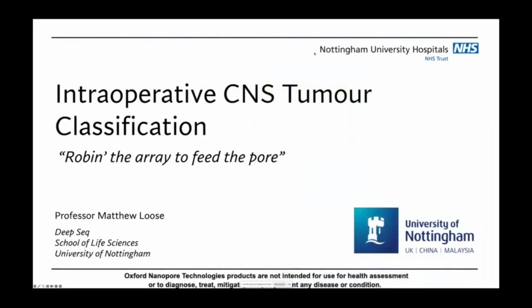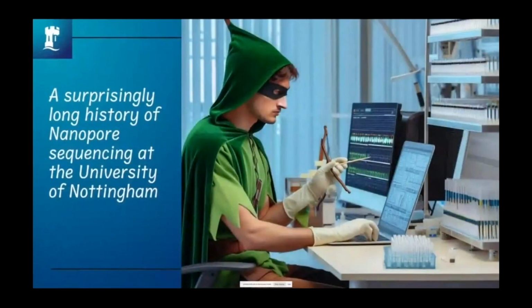Thank you. So thanks for that introduction. It's a pleasure to be here presenting today on the work that we've been doing here in Nottingham on intraoperative CNS tumour classification. And in kicking off, as was already mentioned, we have been using nanopore sequencing for some time in Nottingham.